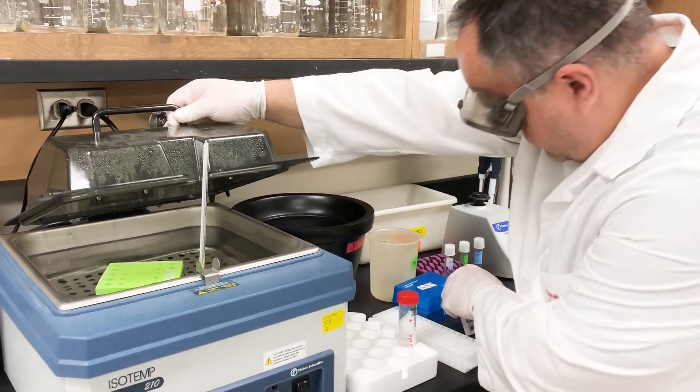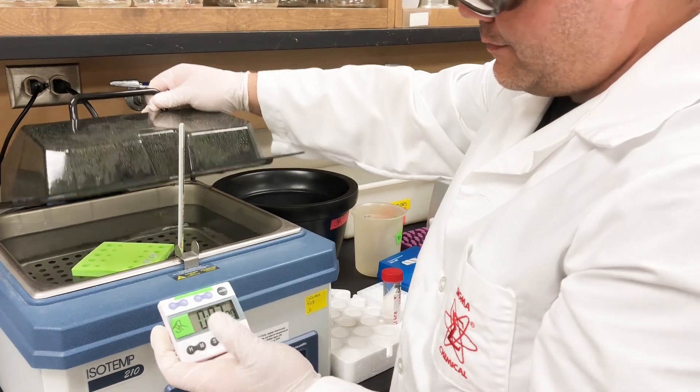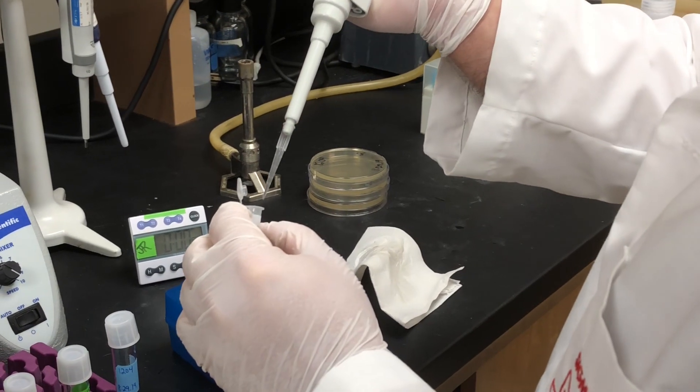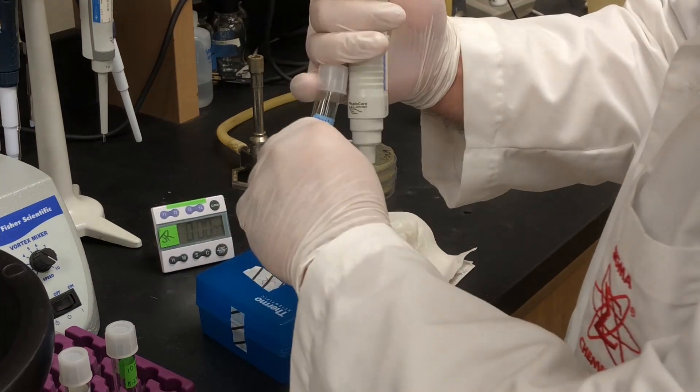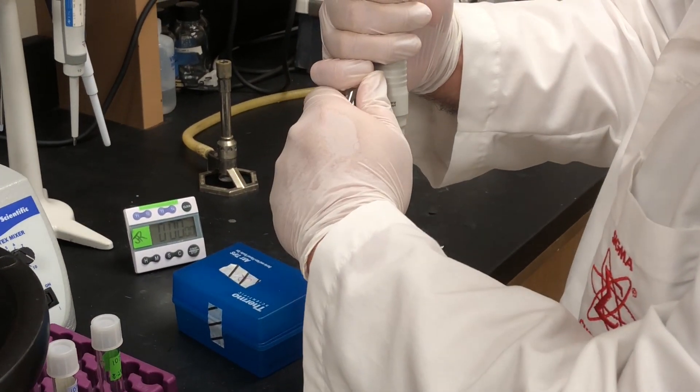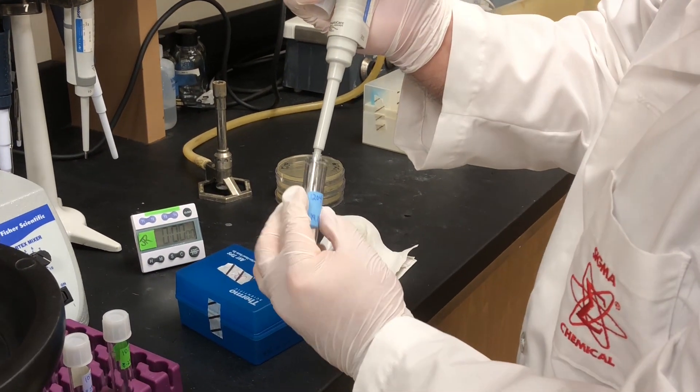Heat shock cells and the disk mixture for 2 minutes at 37 degrees Celsius. Transfer cells only, leaving the disk behind, to 1 ml of LB media. And incubate with shaking at 37 degrees for 1 hour.